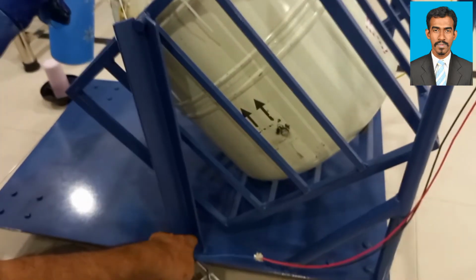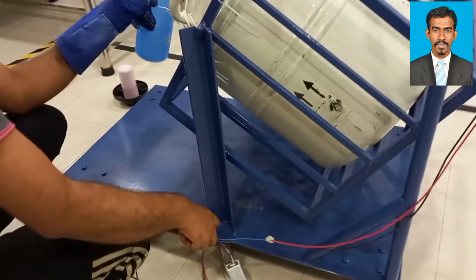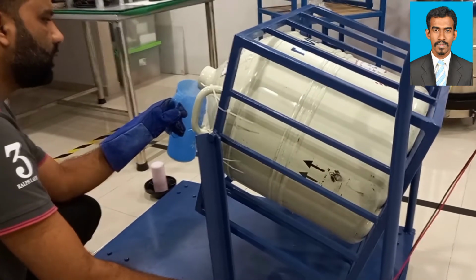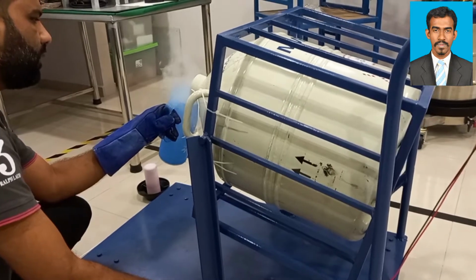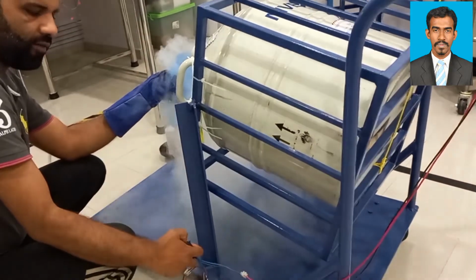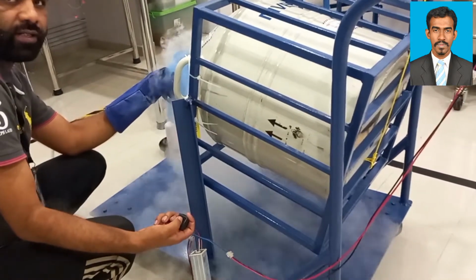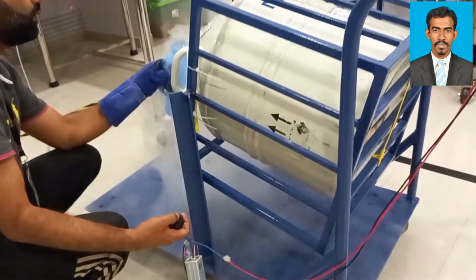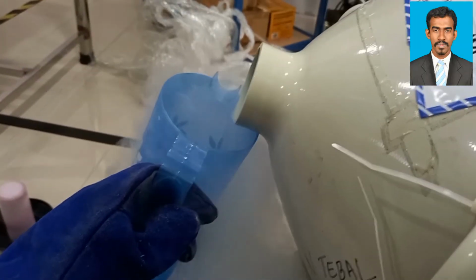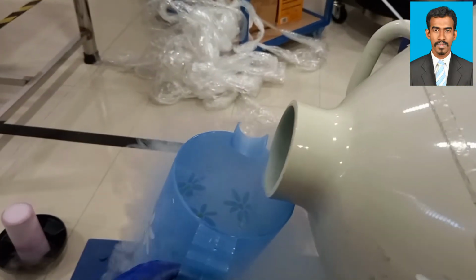This is for the downward movement of the tank. Okay, when it pours the liquid nitrogen into the jug, I stop here, slowly, because I have a control in my hand. You can see, for safety purposes you must wear gloves.